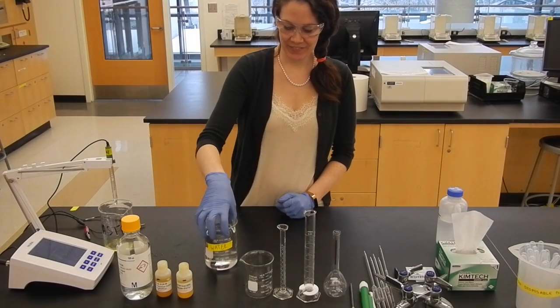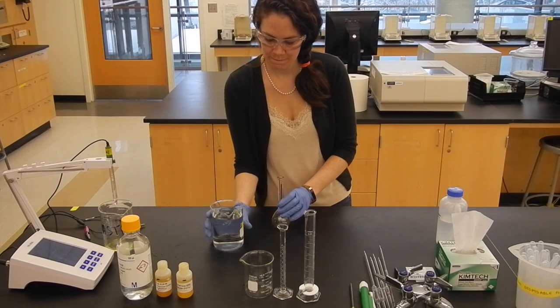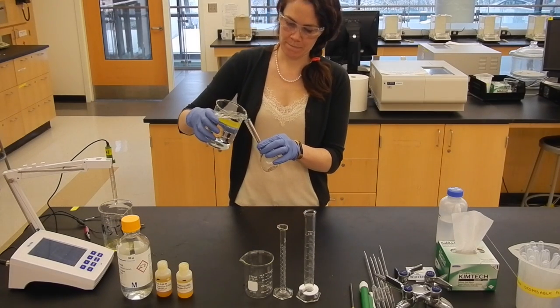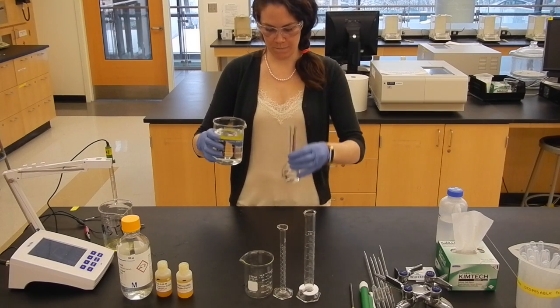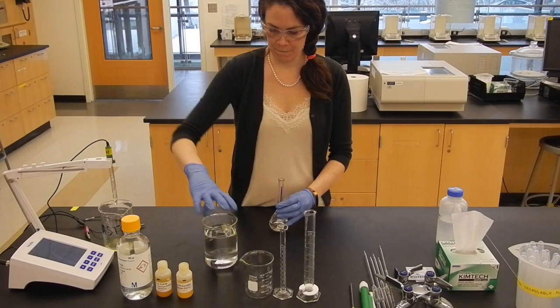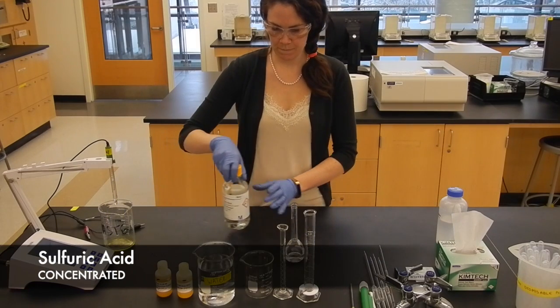Welcome to your electrochemistry experimental video. Today we will be investigating how cell potentials change with varying reagent concentrations. You will later discover how to use this information to find equilibrium constants for a reaction.